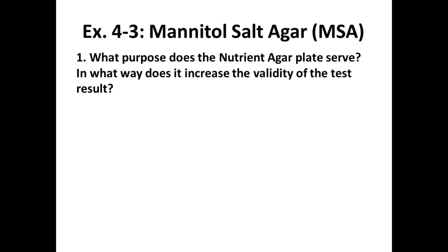Is yours gram-positive? That's Amber's. Yours is gram-positive? Did it grow on the blood agar? Okay, yeah. So yours might be Staph epi. Mike, do you have growth on the blood agar?